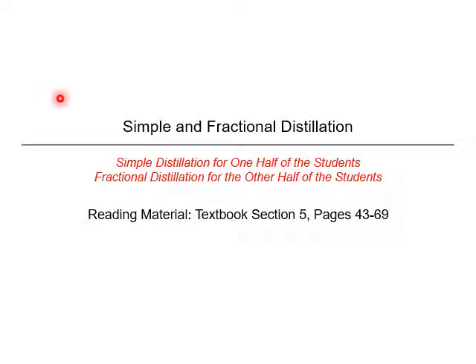Hello everyone. Your class today, today's experiment is going to be about simple and fractional distillation. We have two major types of distillation: simple and fractional.